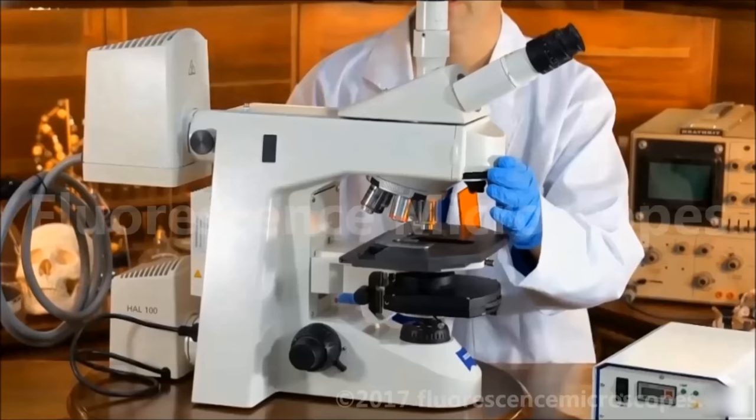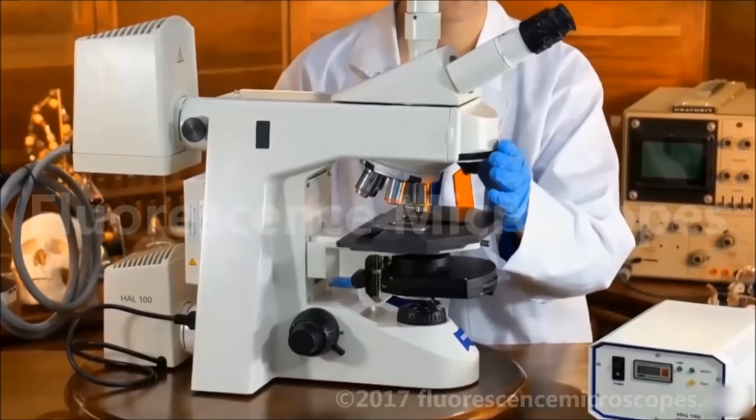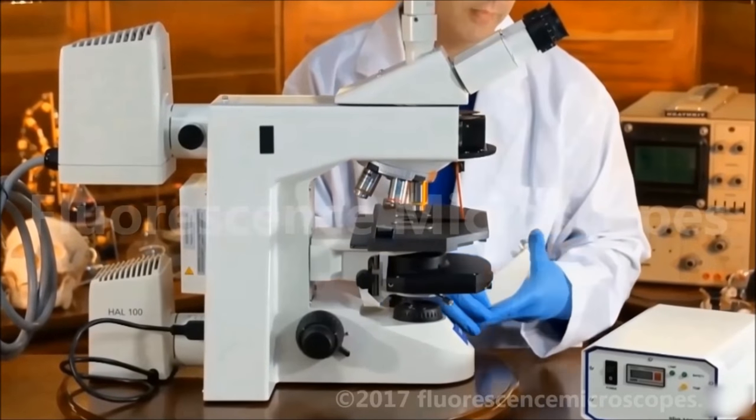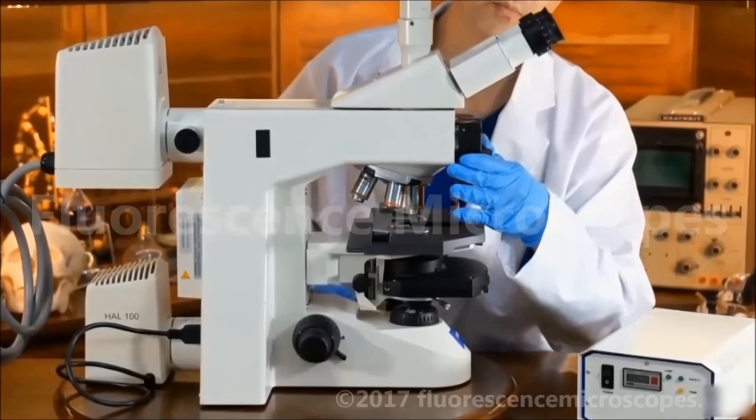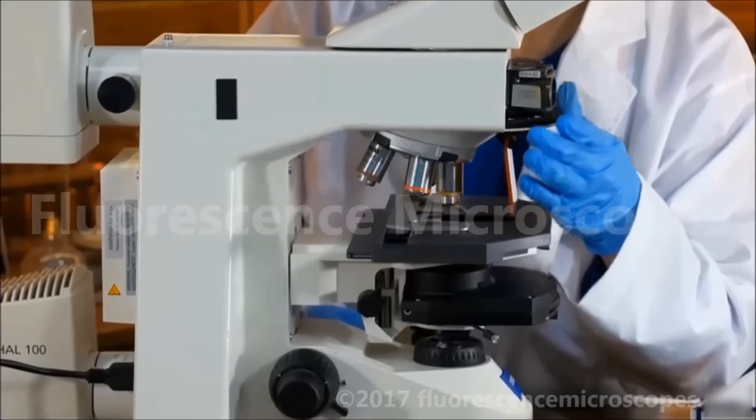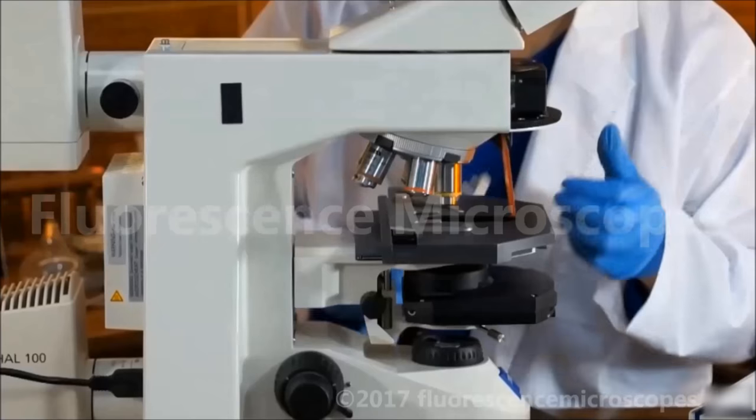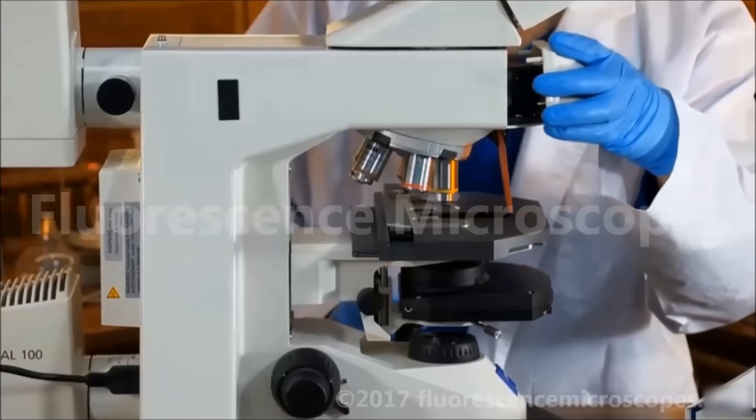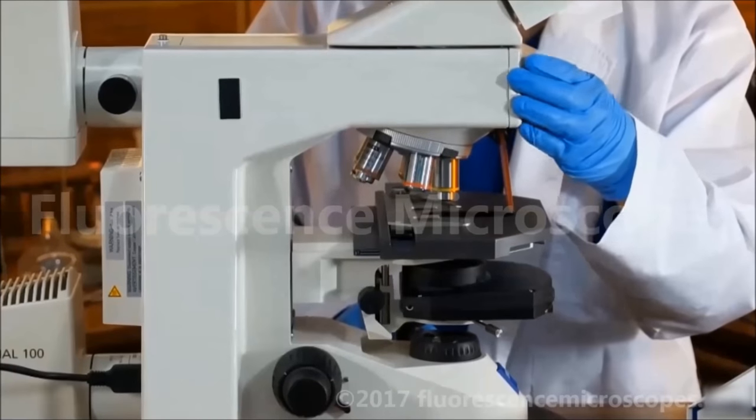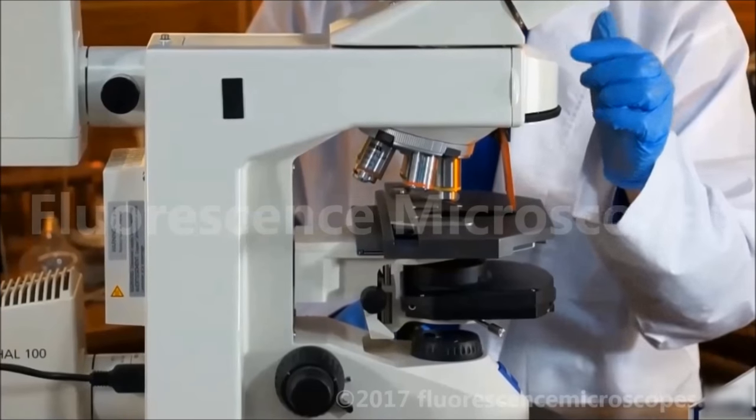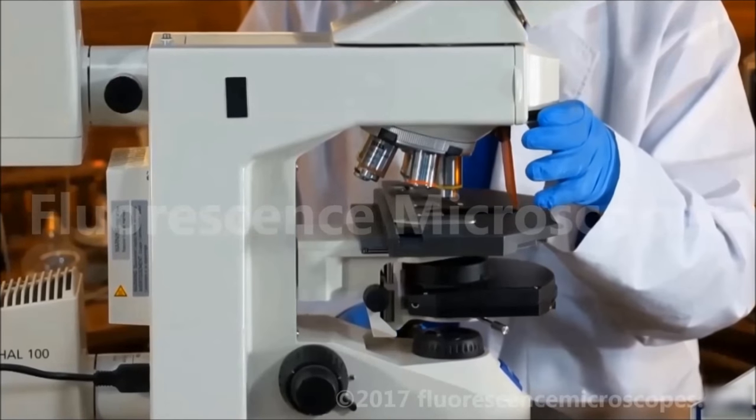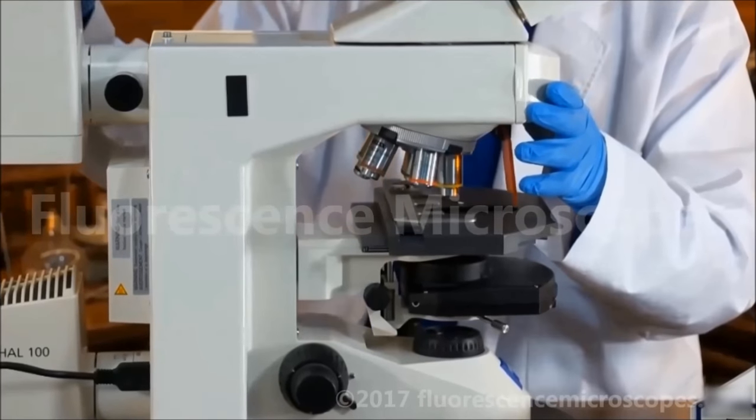Next, we have fluorescence cubes, dichroic cubes, inside the cube holder. There are 3 cubes plus a dark field. The dark field setting is also good for bright field and phase, so bright field, phase, dark field all in one setting, and the others all have dichroic filter cubes for the fluorescence.